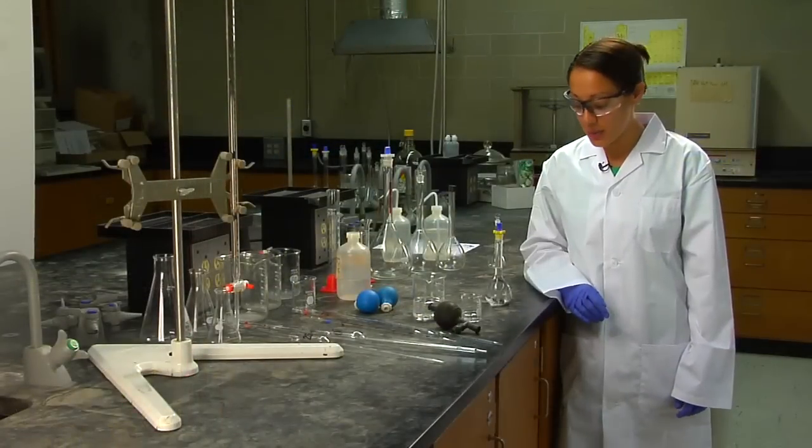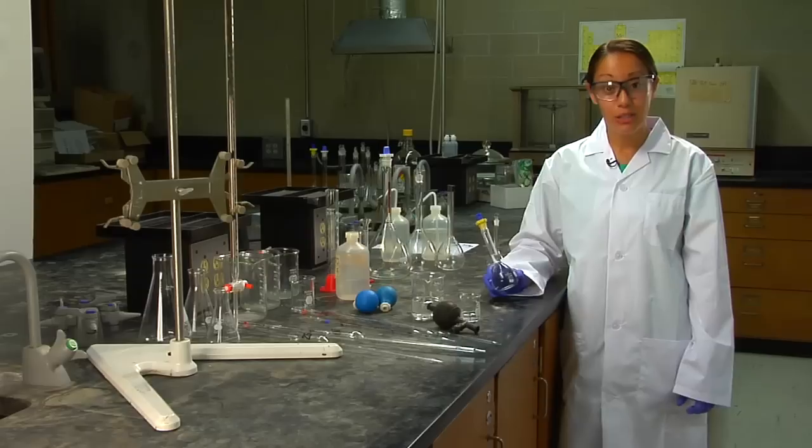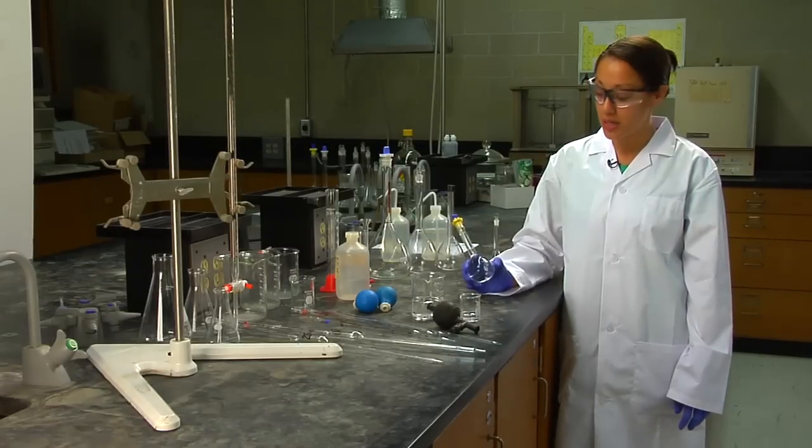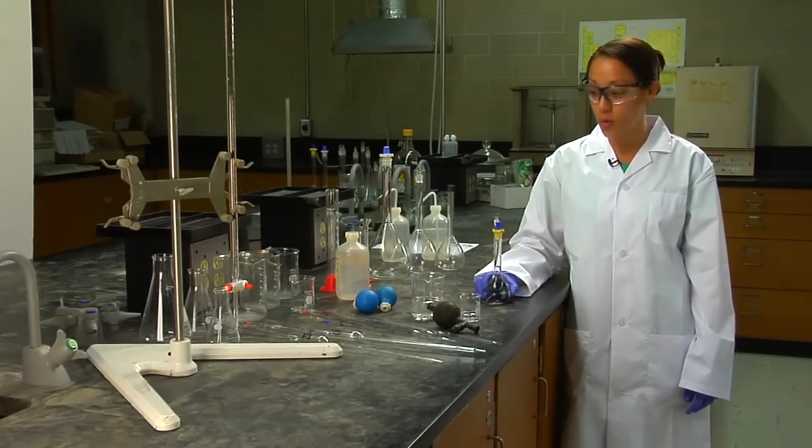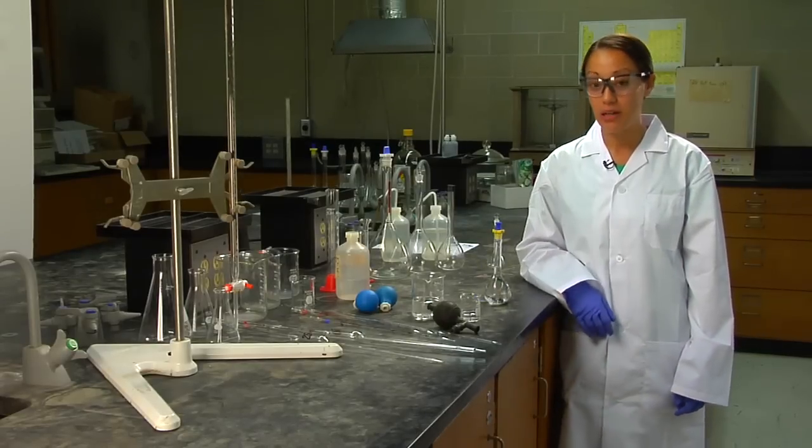That's how simple and easy dilutions can be. You'll be doing a lot of standard dilutions and dilutions of your unknowns through the end of semester. By the end of this course and this year, you'll be experts at preparing standards. Thanks.